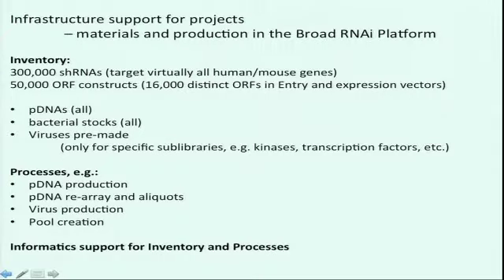Okay. And then also a little bit about our high-throughput virus production, and briefly mention our pool creation part as well. So we do have a lot of informatics support within our library just to handle the size of this inventory, just from plate tracking, just loading stuff to our database, and also to help the automation process of our lab work.